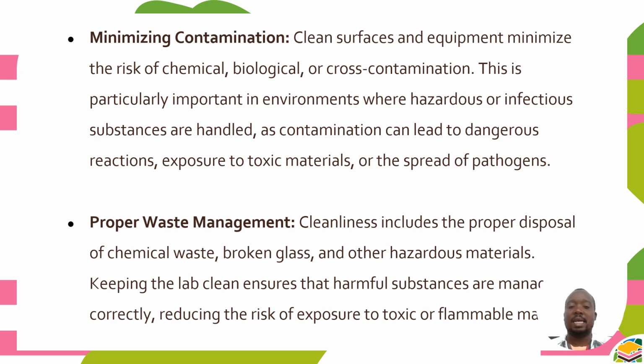Keeping the lab clean ensures that harmful substances are managed correctly, reducing the risk of exposure to toxic or flammable materials. So yes, cleanliness ensures safety, it minimizes contamination, and it ensures proper waste management.